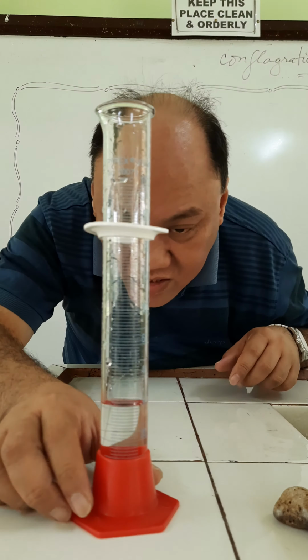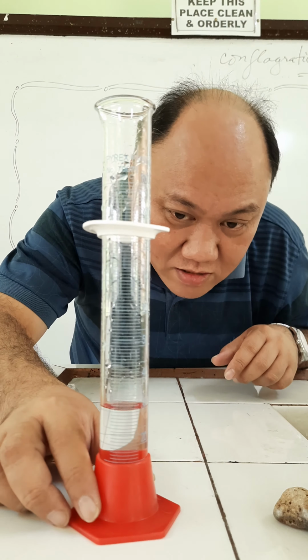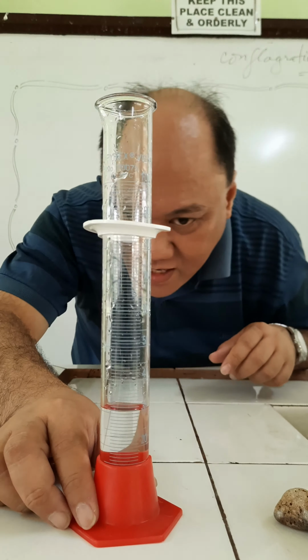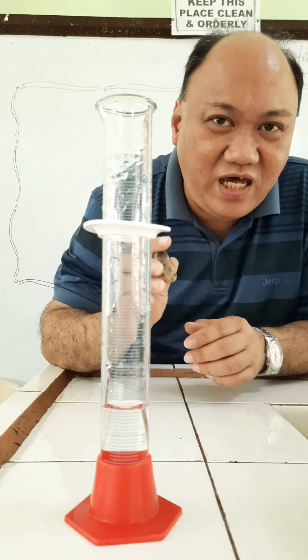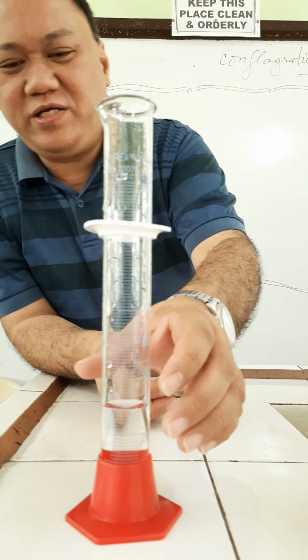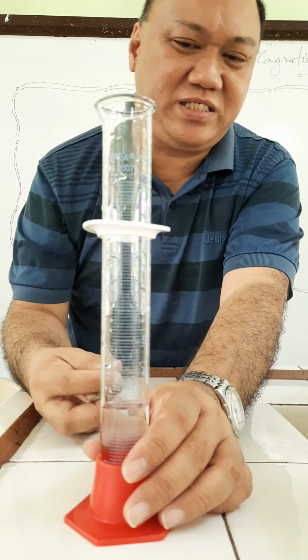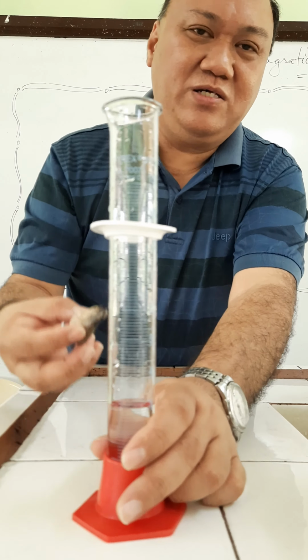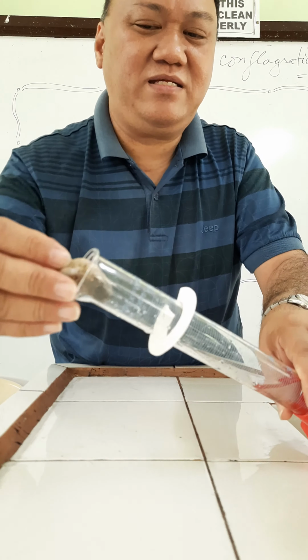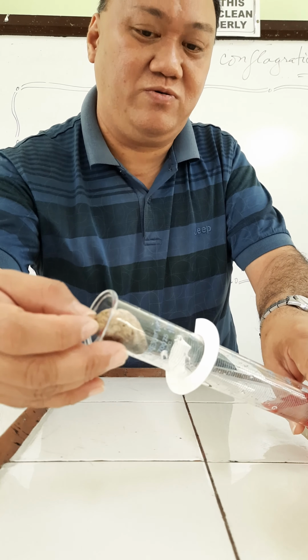So if you could notice, based on the lower meniscus mark, okay, 30 ml. So that is our initial volume. Now, I will add in the pebble, taking care not to splash the liquid out of the graduated cylinder, and also to protect the glass container. So I will insert this pebble in a slanting position, slowly.